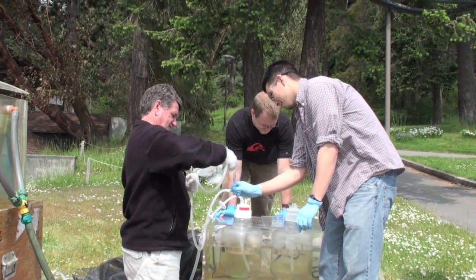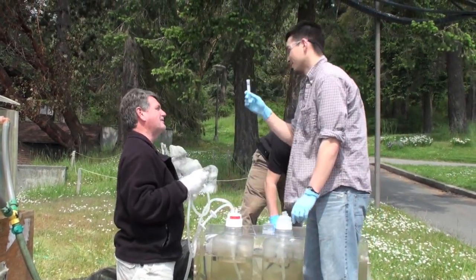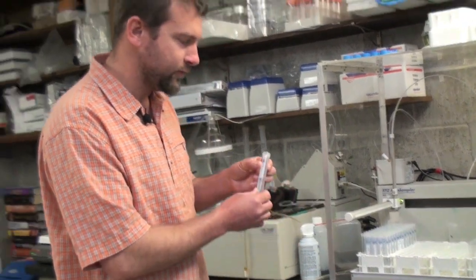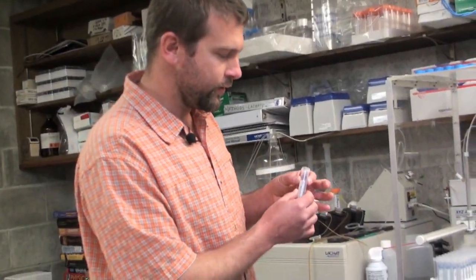The scientists who are working on the experiments outdoors will bring me a small vial of seawater and in this water there will be various sources of macronutrients: nitrate, phosphate, silicate among others.